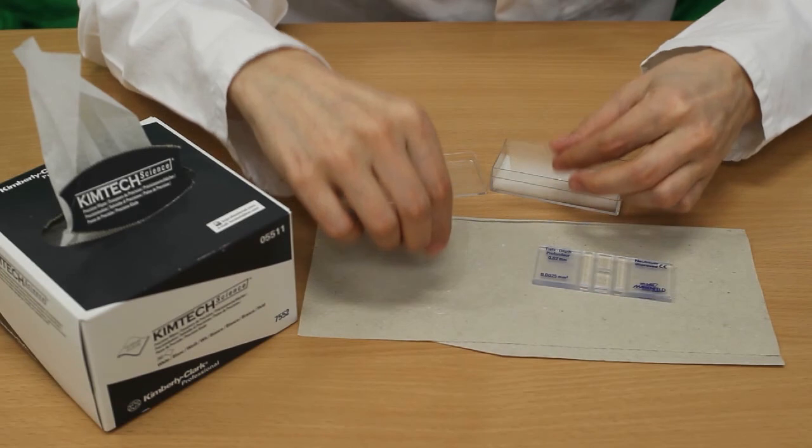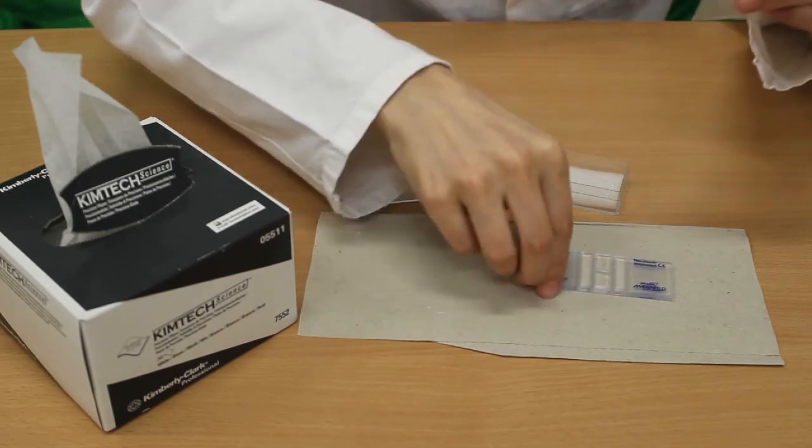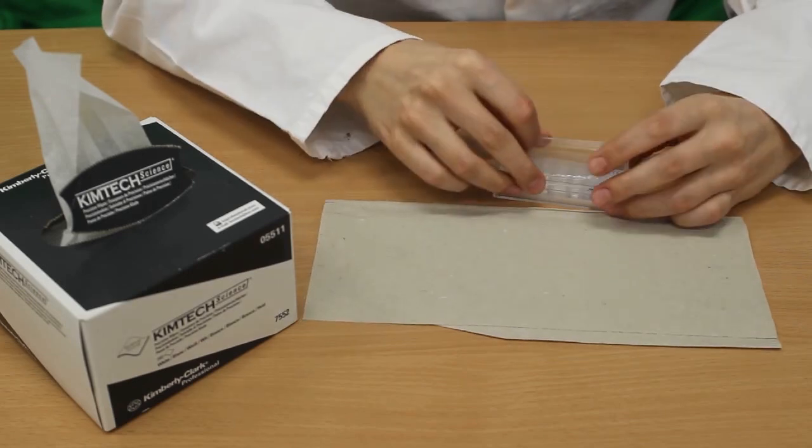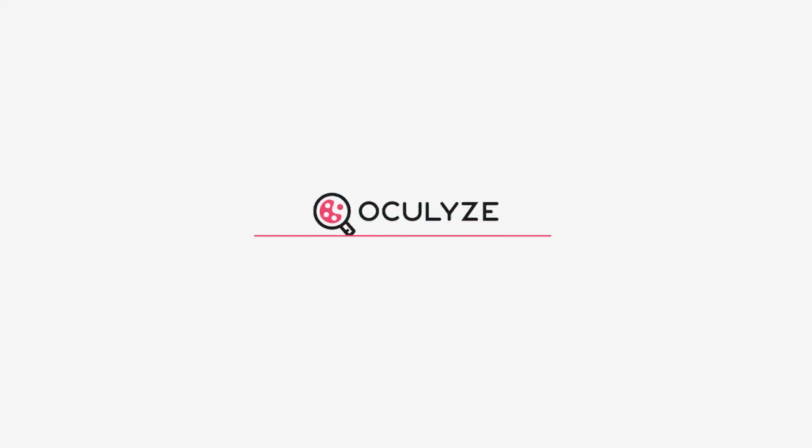Finally, when everything has dried, place the cover slip and the slide back in its box. Doesn't sound like you want to do this every day? Check out our resource section on automatic cell counters or visit our shop.